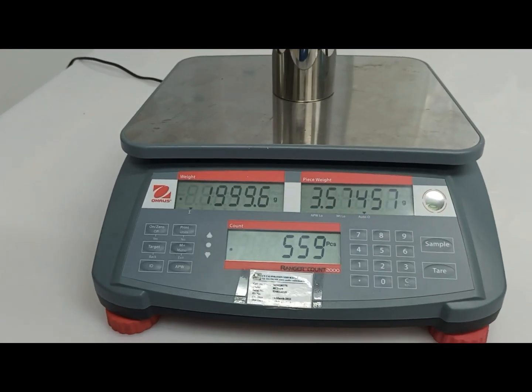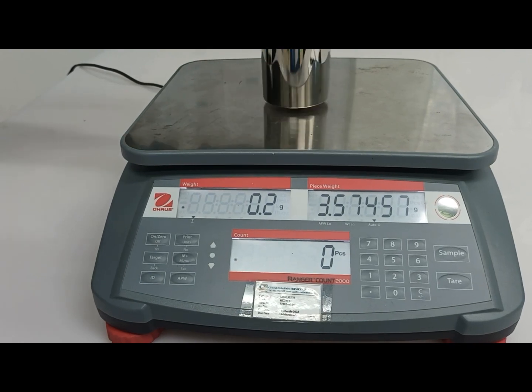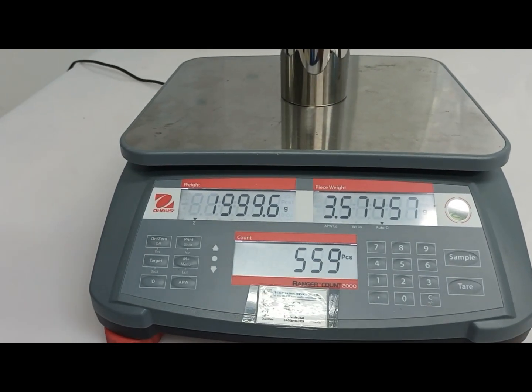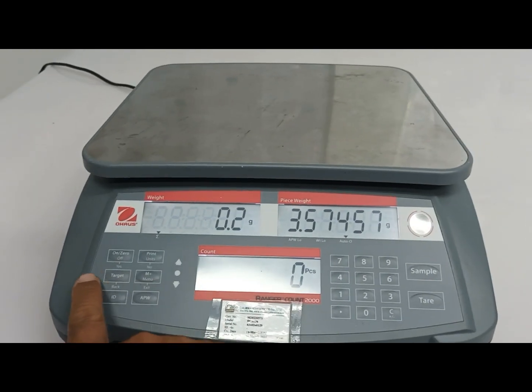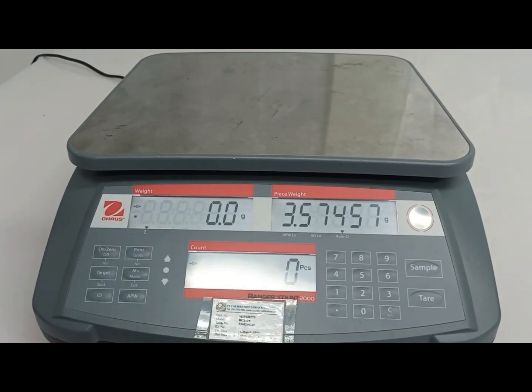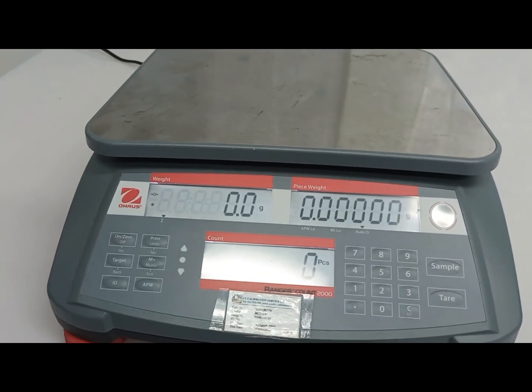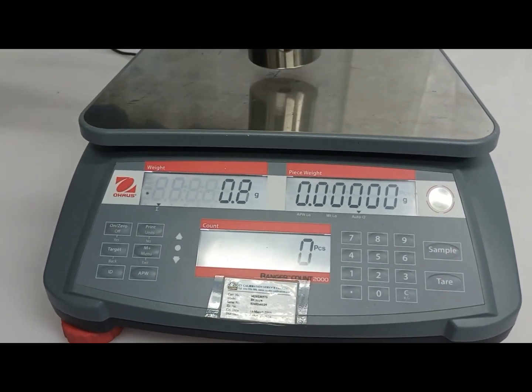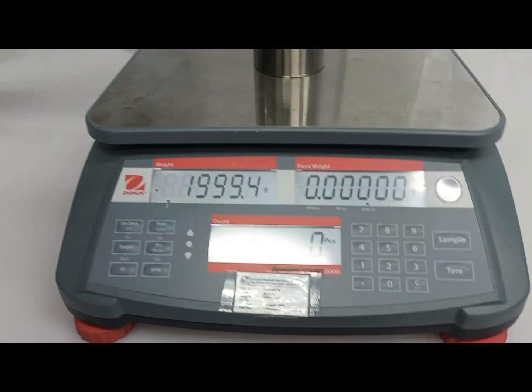Before the calibration, I will check with the standard weight. I check 2 kg. I will tare to 0 and check again. Not correct.